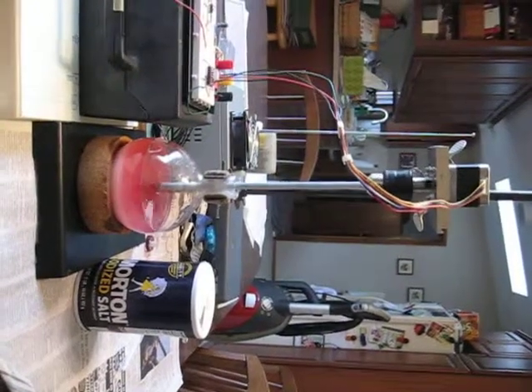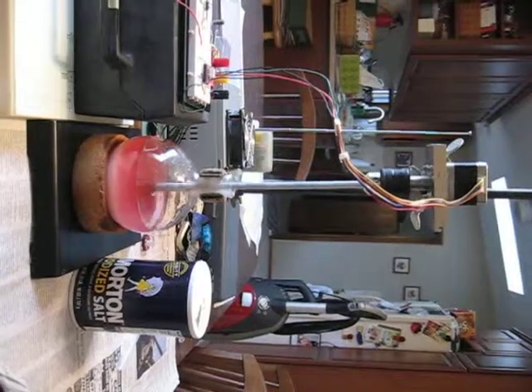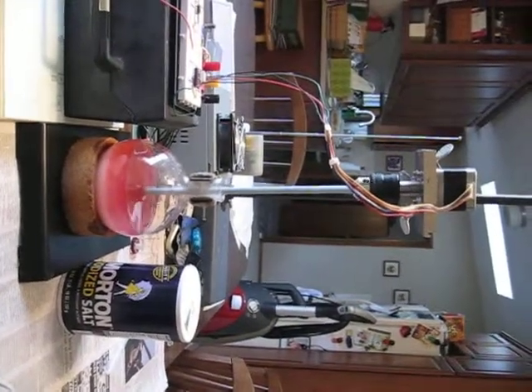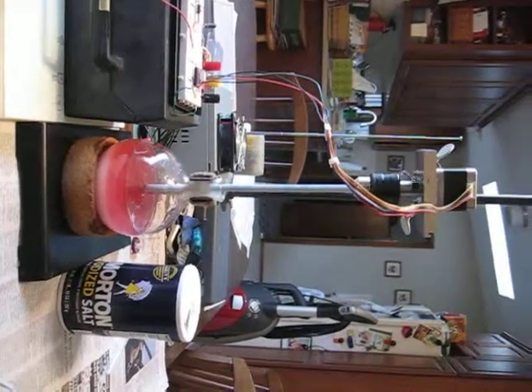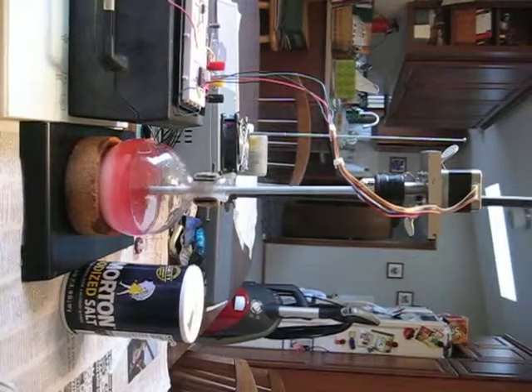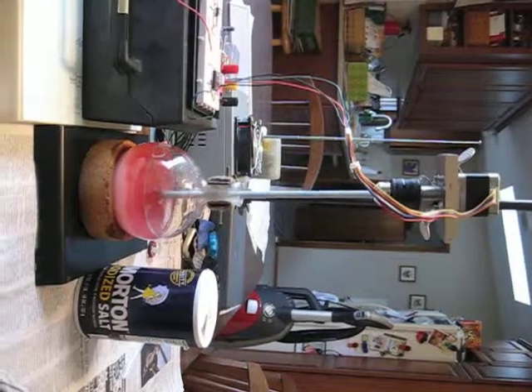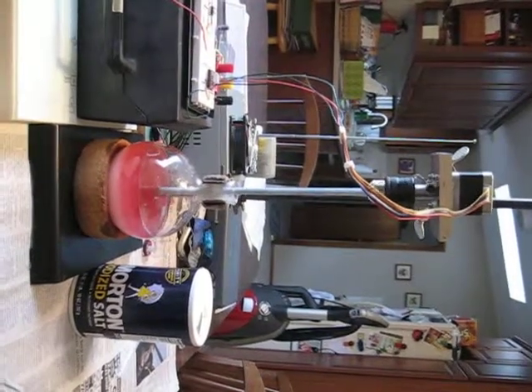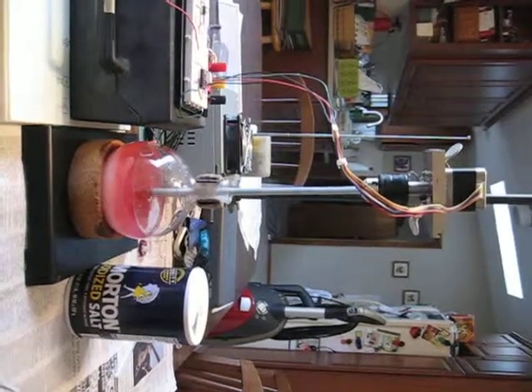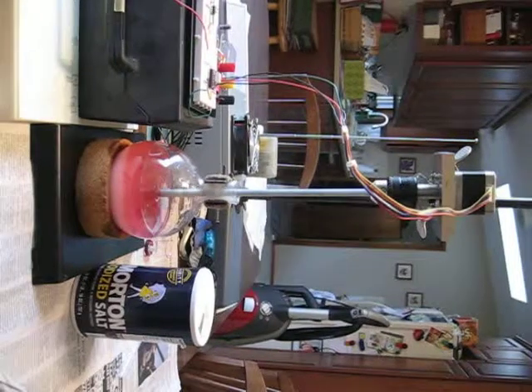This shows a stepper motor driven agitator stirring about 250 milliliters of water with salt added to give a slurry, as can be seen in the lower part of the flask. It's stirring at 46 RPM and does a good job of moving the salt around, no problem at all.